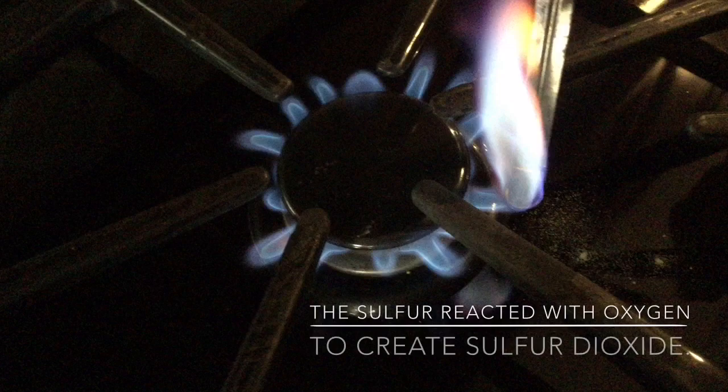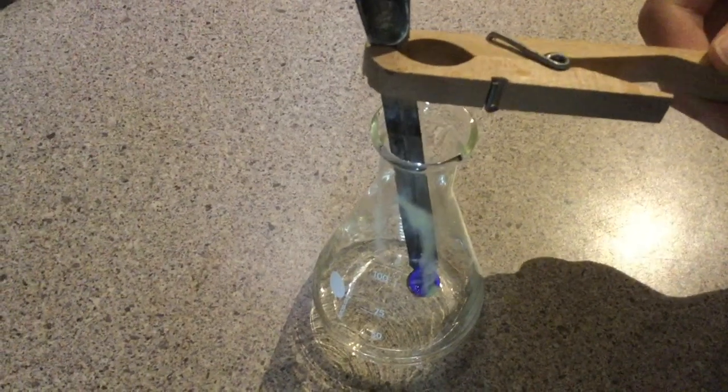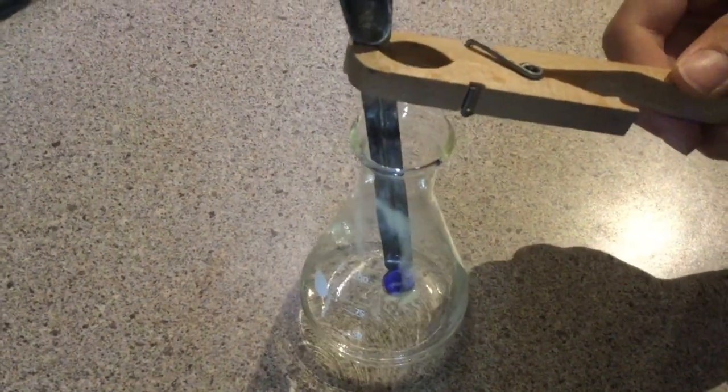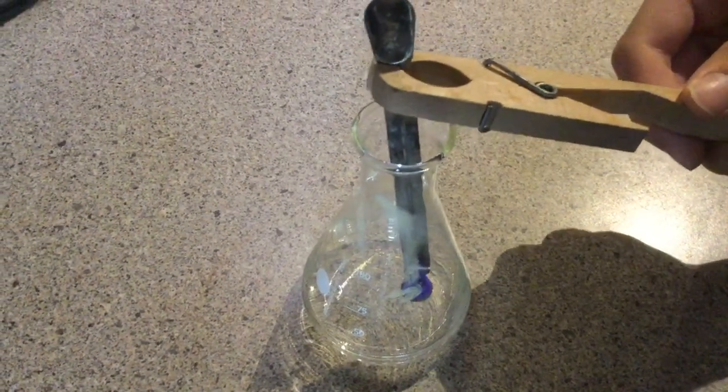Burn baby burn! Next up, I dipped the hot spoon into the Erlenmeyer flask, but I also made sure that the spoon didn't touch the water, otherwise the sulfur would stop burning.